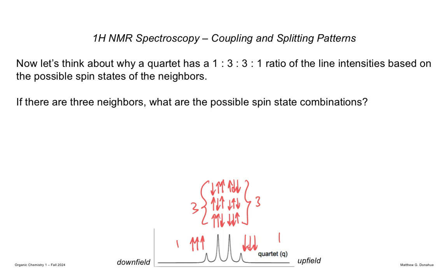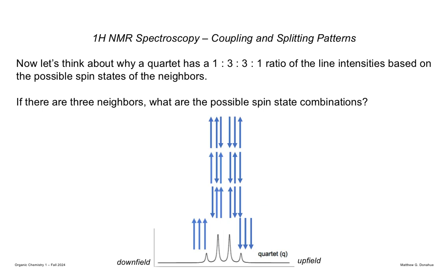So as we look at more of these spectra and do problem solving, you'll find that fragments that are sort of blocked will always have a unique signature to them. So there's the slide with them drawn in.